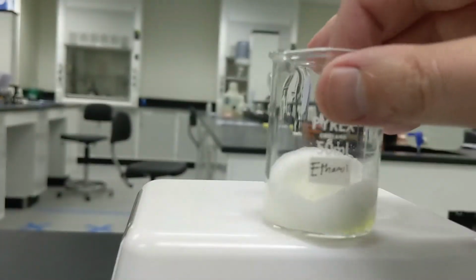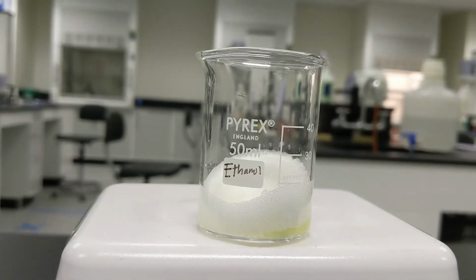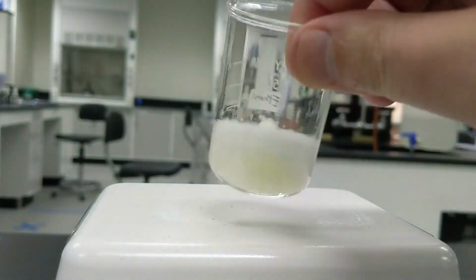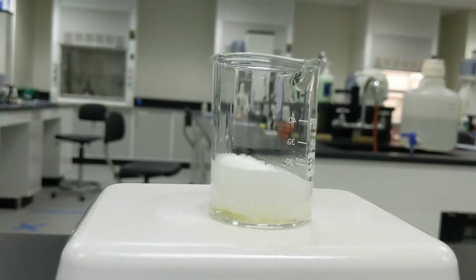Okay, so this is a type of colloid. Again, it might have been a little bit better if I had used a whisk or fork instead of a stir bar, but this is a type of emulsion between a liquid and air, which I won't say the name of. This, by the way, is not ethanol. Ignore the label. This was an egg white. Pretty cool. Okay, so this is a kitchen method people use to make something called a meringue. Pretty impressive.